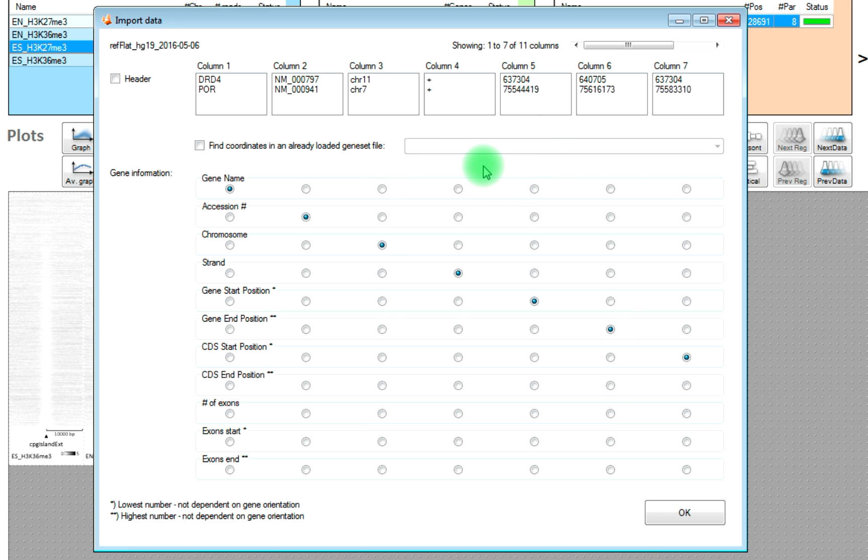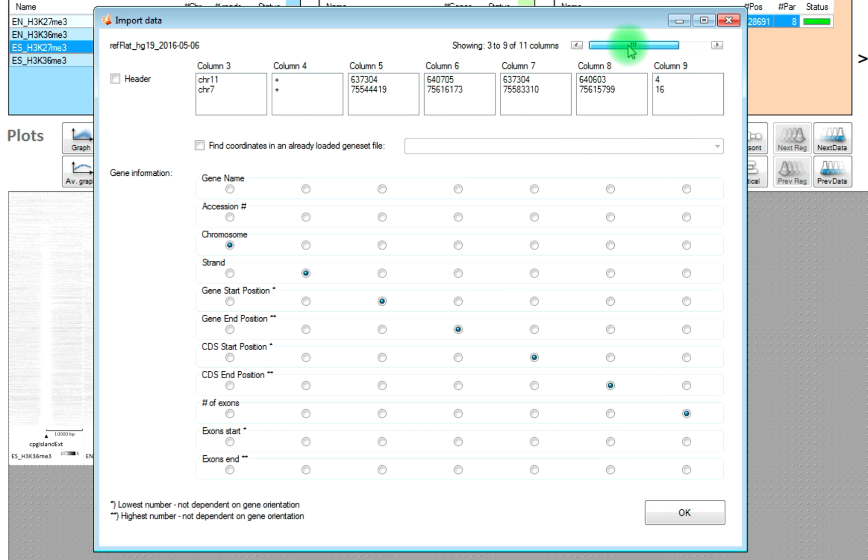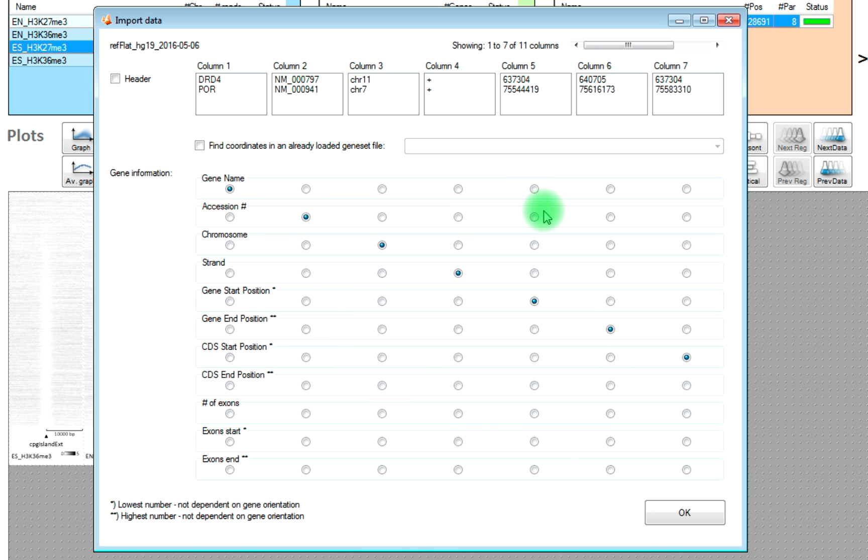ESEC will know the format of the imported gene sets from UCSC, so it will make a correct interpretation of where to find and which columns to find the appropriate information. So you don't need to change anything here.